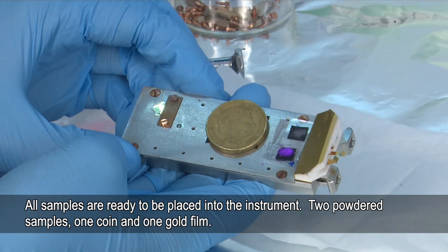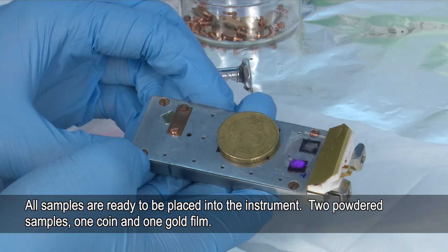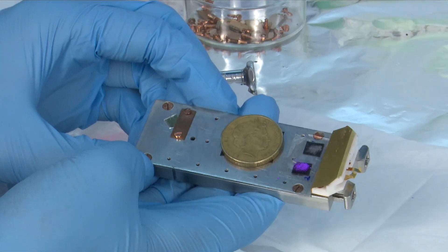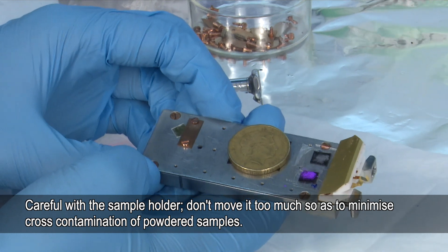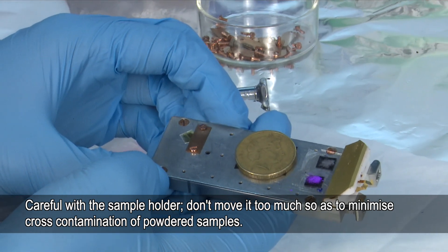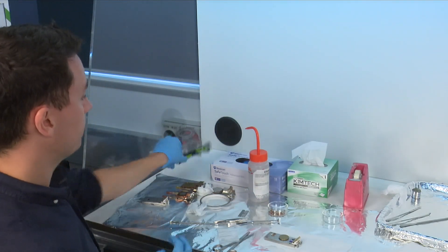So now we've put all four samples onto the sample holder: the two powder samples, the coin, and the metal film. Even though we've handled the powders, it's important not to move the bar around too much in case there's any potential contamination. And that's it — we've now prepared some samples onto the sample holder. Now it's time to put them into the instrument and start the analysis.